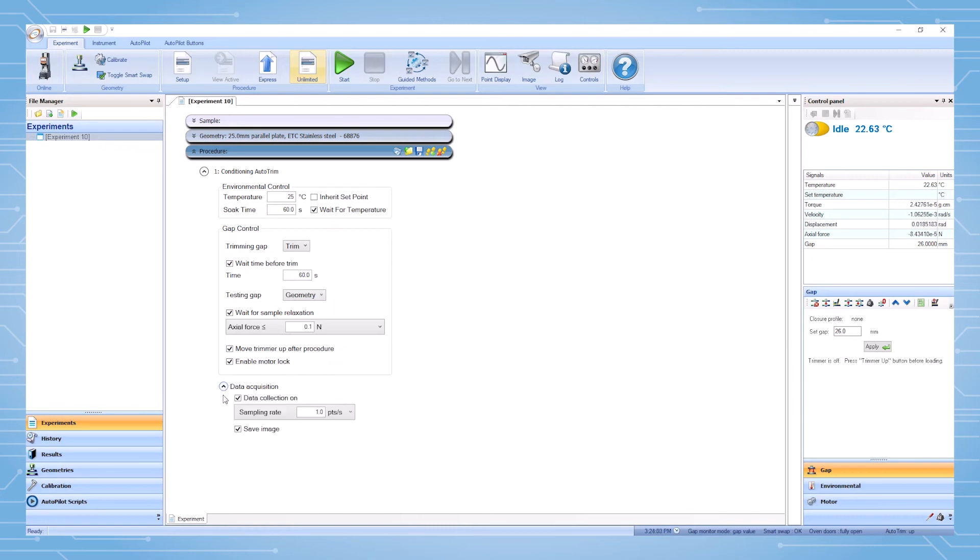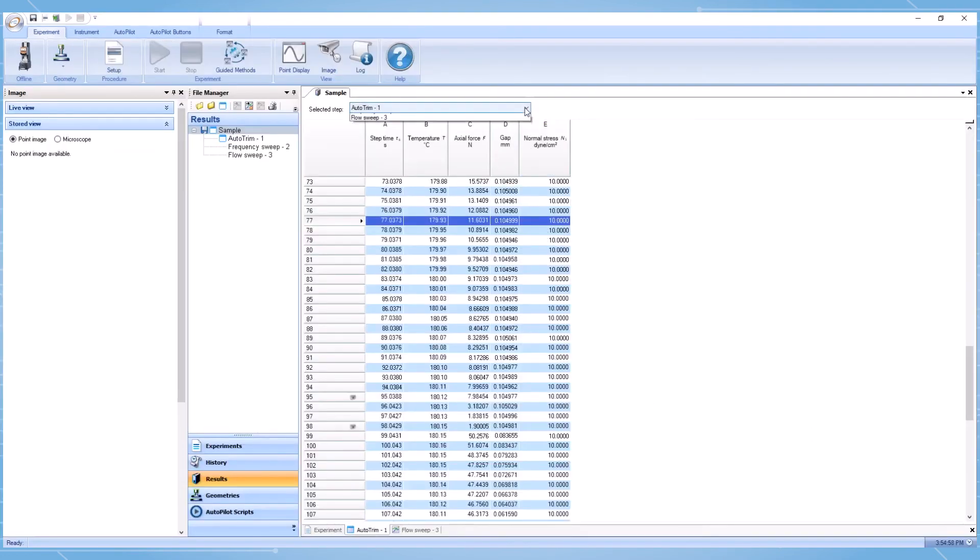In data acquisition, save image may be selected. If a camera is installed, a photo will be taken before and after the trimming step during the experiment. These images allow the user to monitor the trim of each sample.